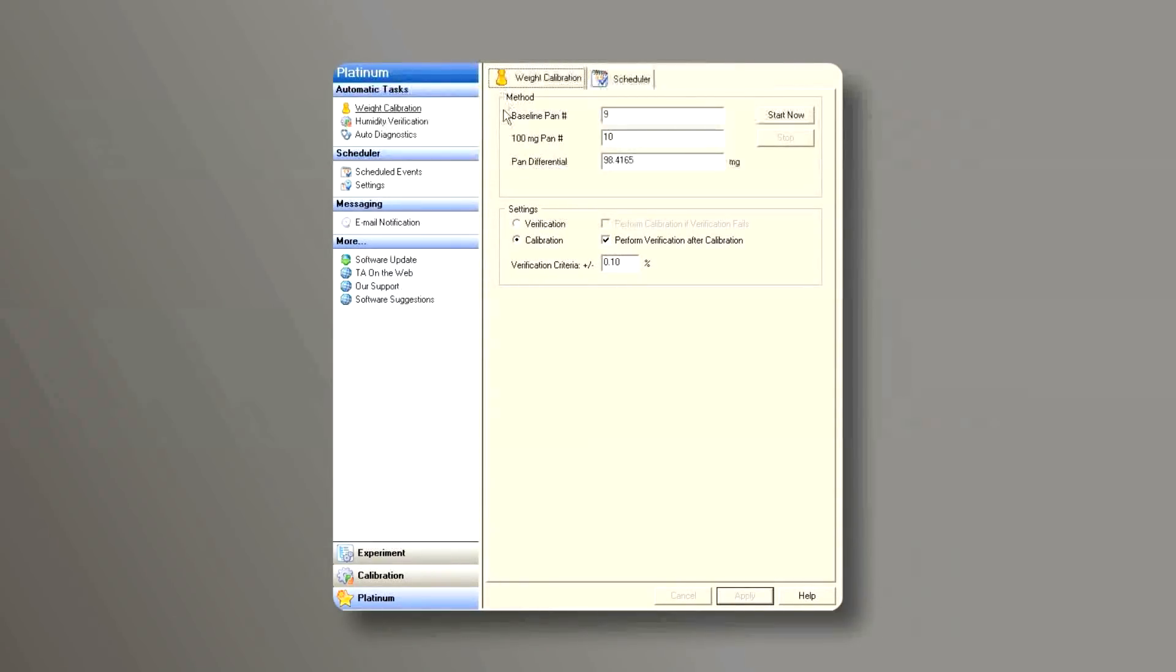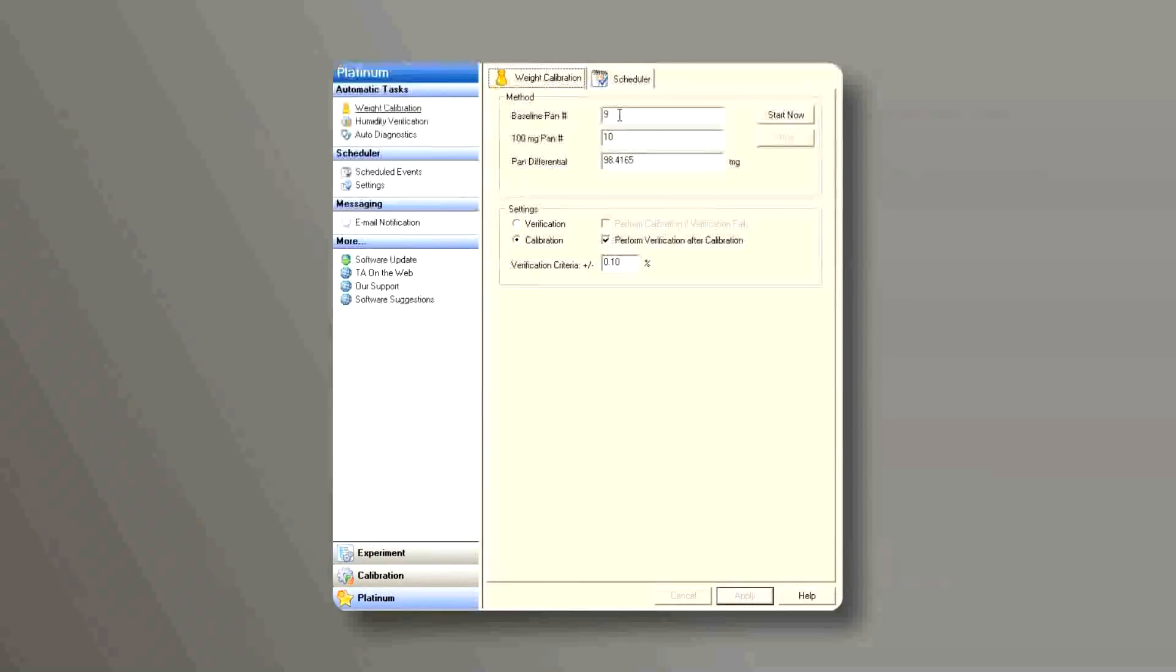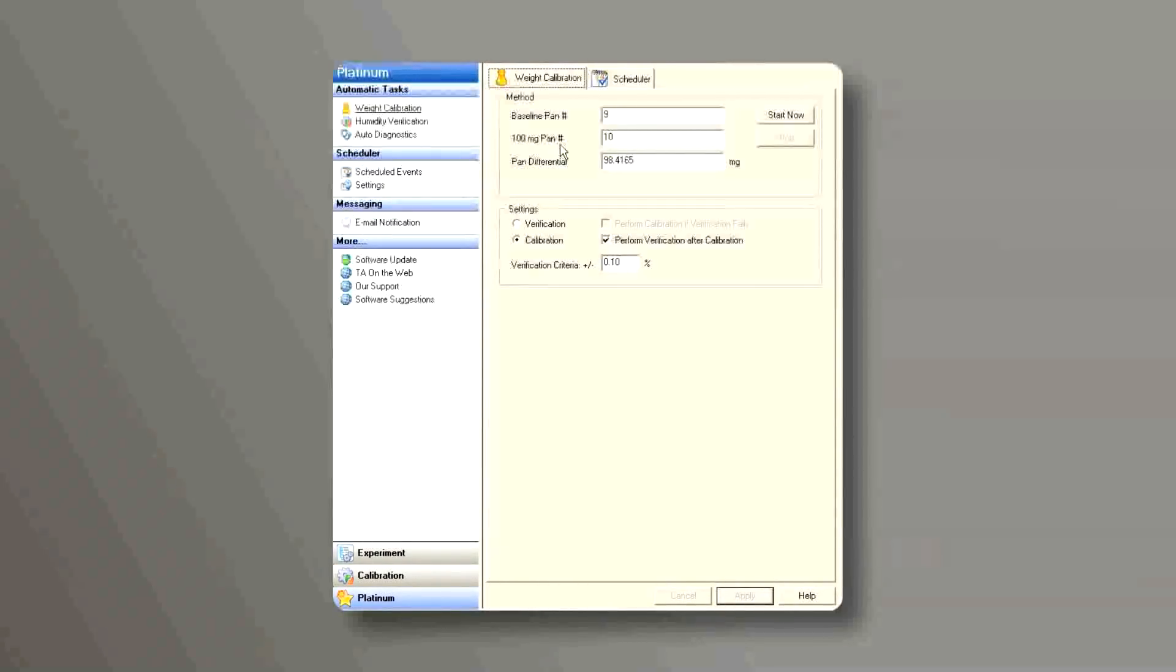Underneath the method, there is baseline pen number. We put pen 1, that's the baseline pen, on position number 9, and pen 2 on position number 10.